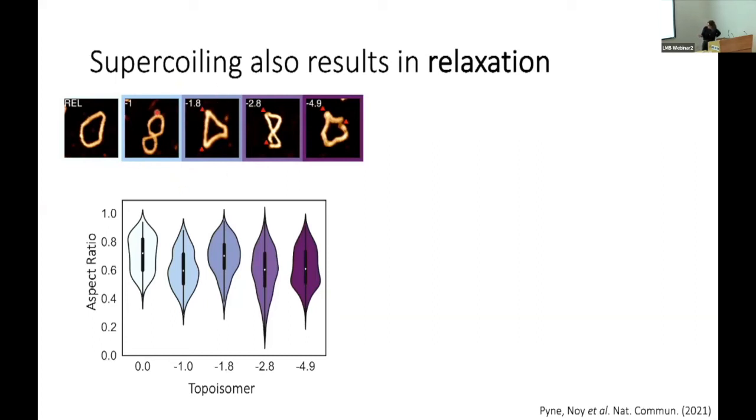So just on the left of that range, you have nice strong bends and rise for recognition for things that require those kind of things. And then just on the right, not very far away on a free energy landscape, you have very sharp kinks with long linear regions. So you have a piece of DNA that when it's in a small bend, that you might imagine might happen at, say, a plectoneme tip, you have the ability for it to buckle and form defects where you have recognition sites, which are just structural. We're not talking sequence here, where you have a strong bend, a crossing, a kink, or a linear region. So DNA is finding a way to offer its substrates anything it needs with just a very small perturbation to its level of local supercoiling. And that's quite important in recognition.